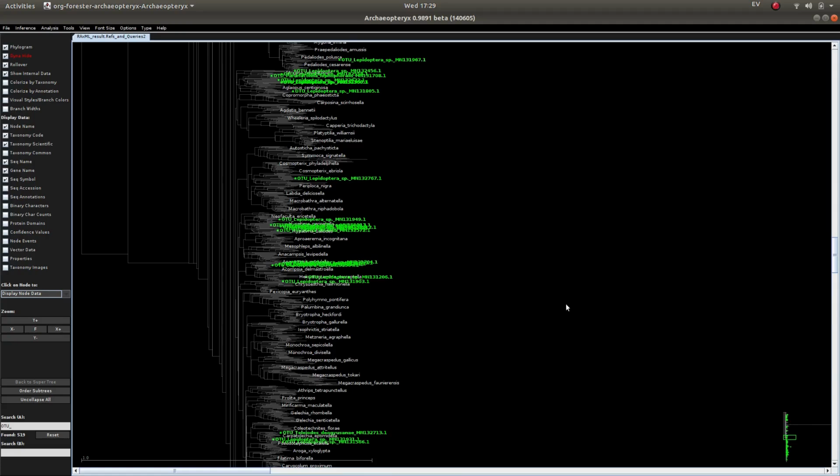And this job is done. So we have placed a set of community DNA of Lepidoptera herbivores from a tree diversity experiment into a large synthesis reference phylogeny, keeping the topology of the references. Now this enables us to have a much more accurate framework for calculation of phylogenetic diversity indices.